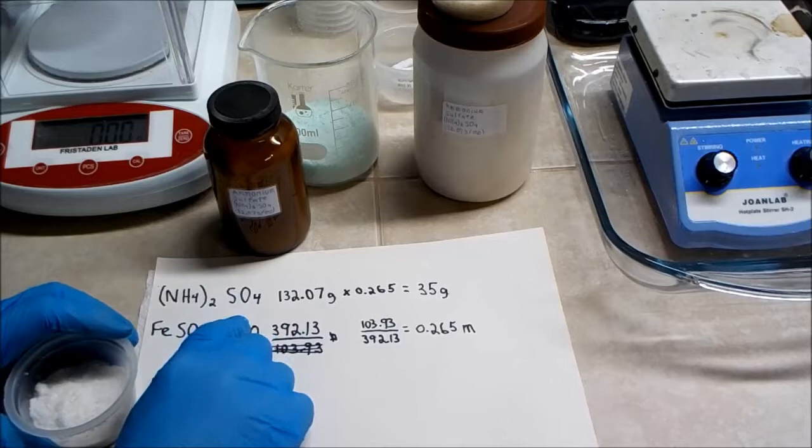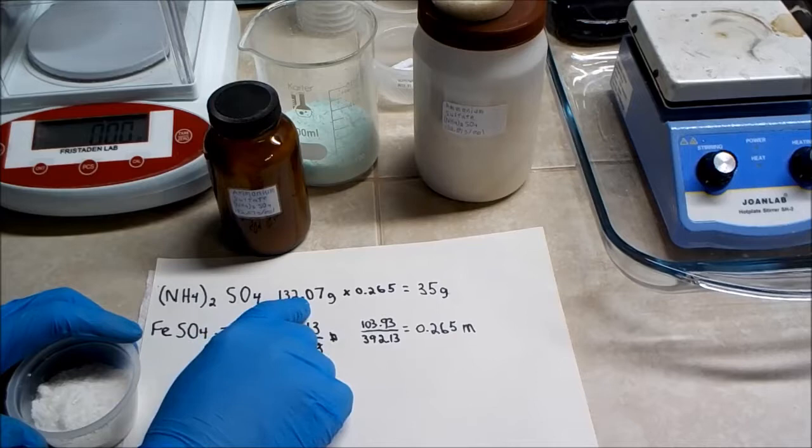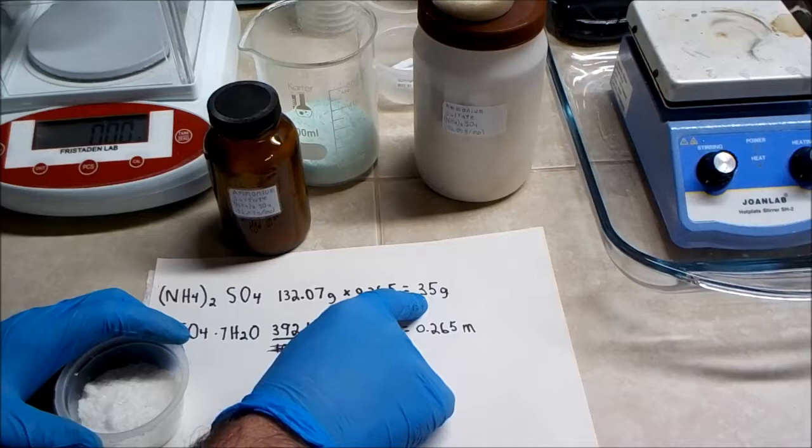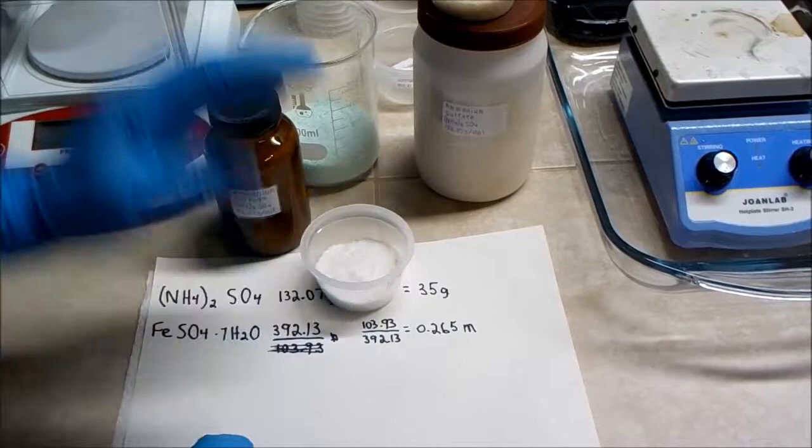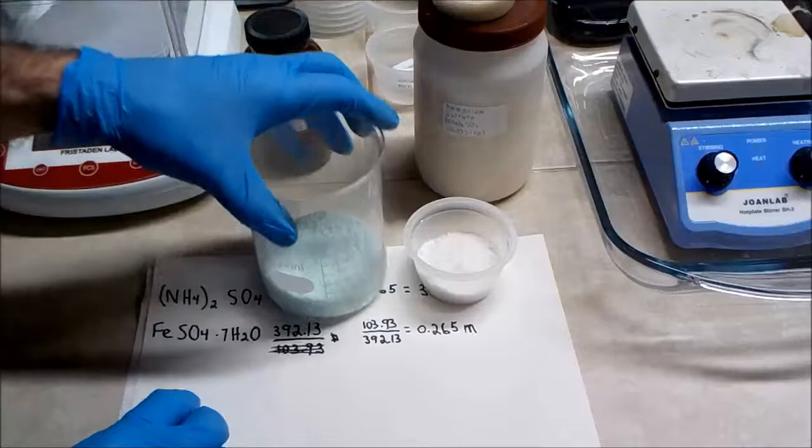Now the molecular weight of ammonium sulfate is 132.07. Multiplied by 0.265, that means I need 35 grams of ammonium sulfate. And I have already weighed that out here. This is 35 grams. So I'll be mixing these two together, dissolving it in water, then letting that recrystallize and getting the Mohr salt crystals.